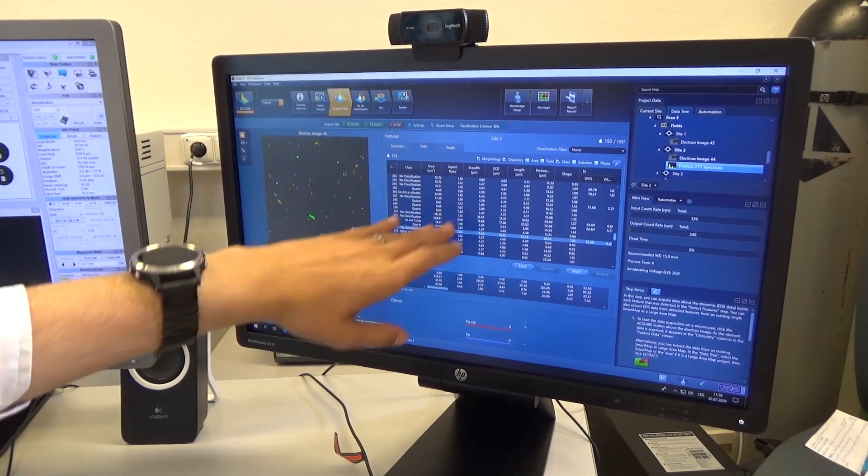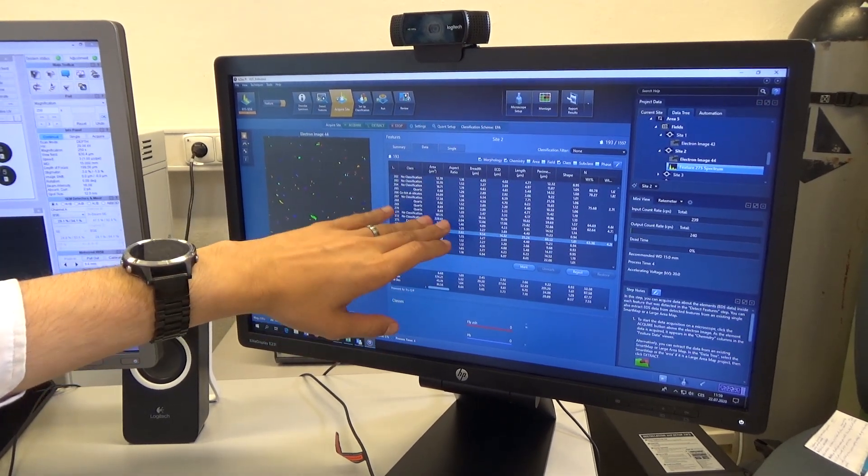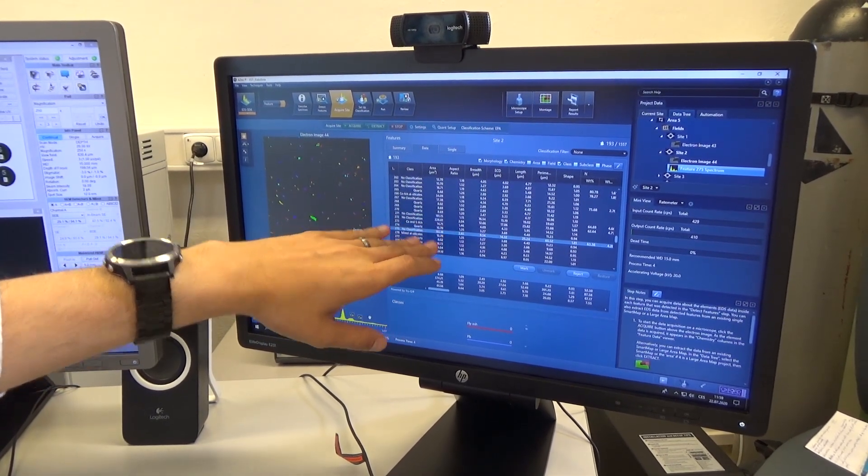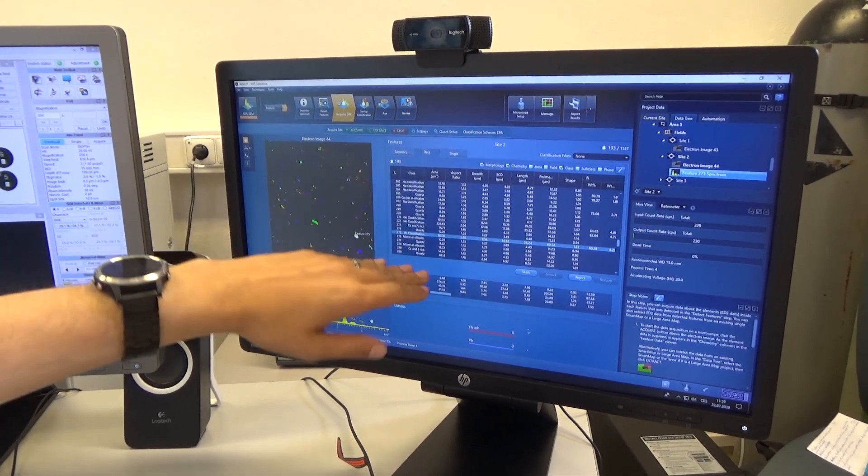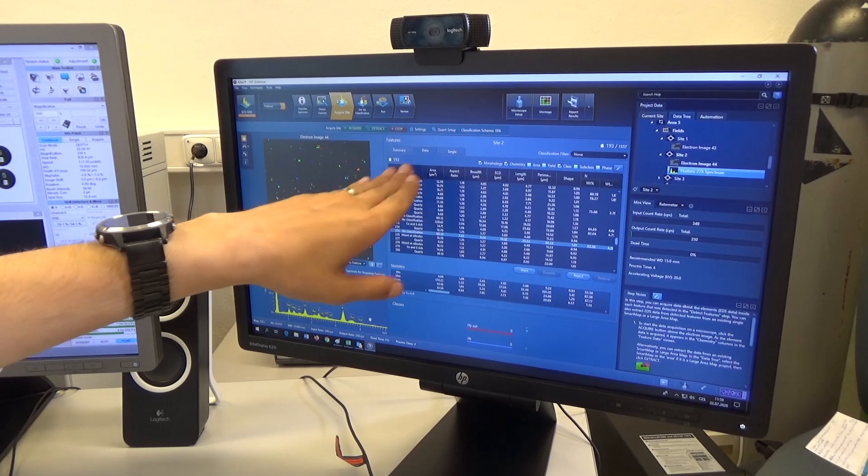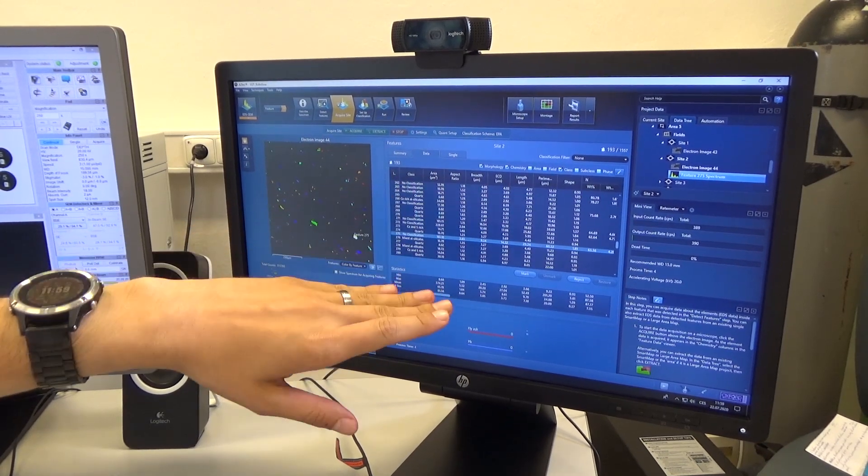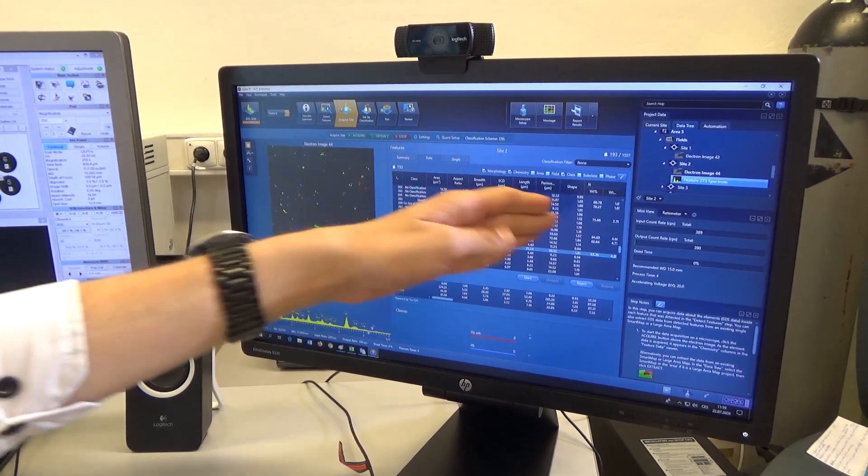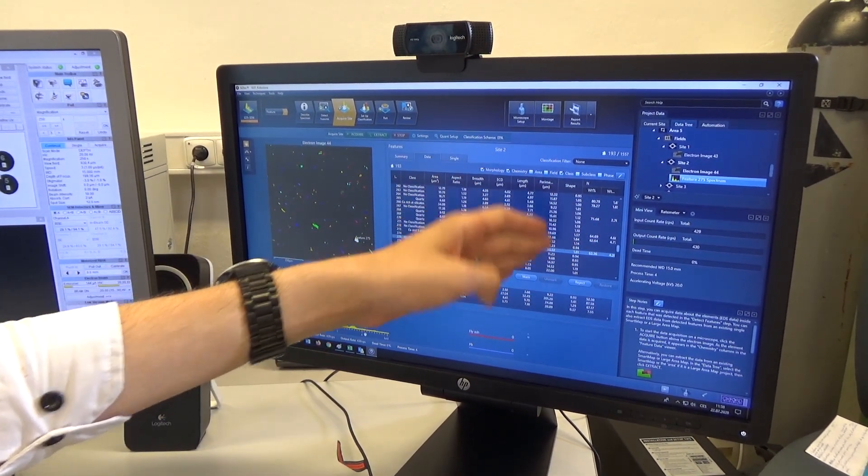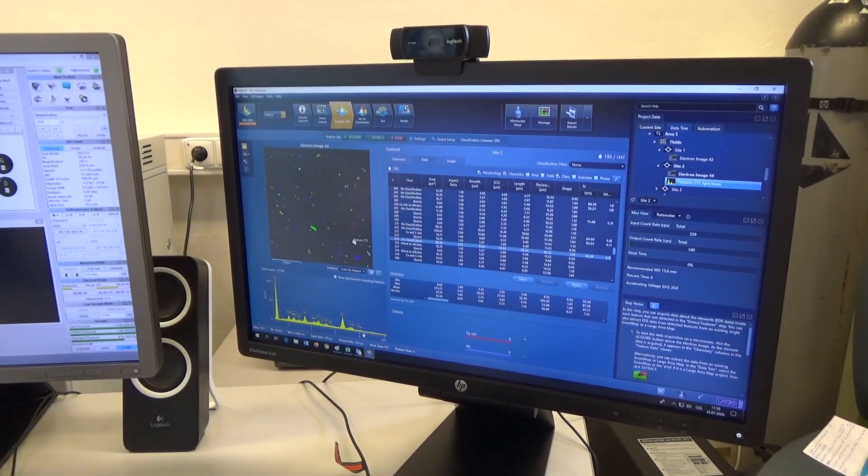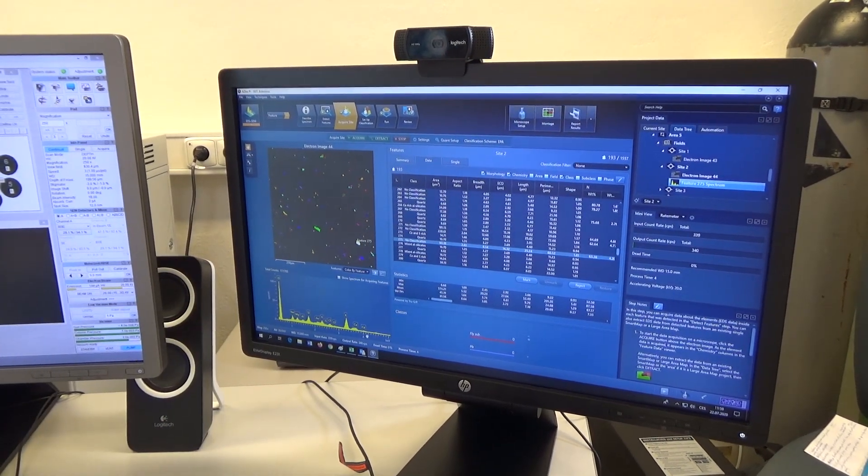This way we can predict what's in each particle and identify its potential source, using information about its shape and size.